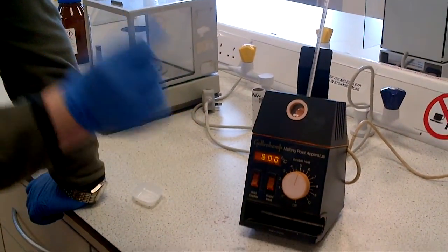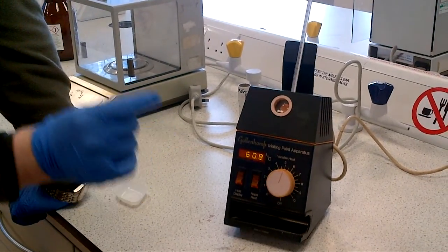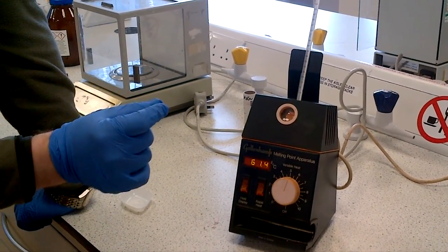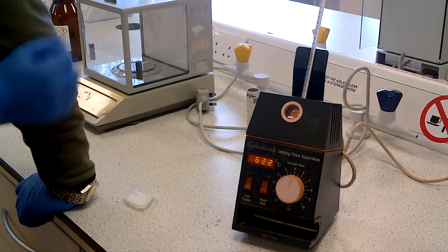So that is your range of melting point. Do a rough one, then let it cool, do a second one, maybe a third one, to get a good estimation of your melting point, and that concludes this instruction guide of how to use the melting point apparatus, thank you.